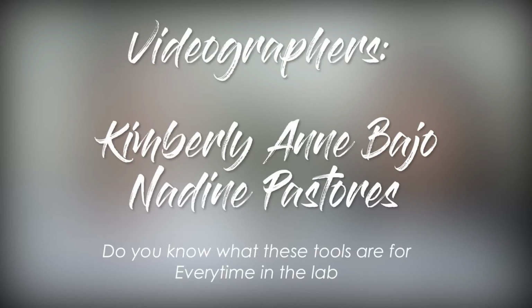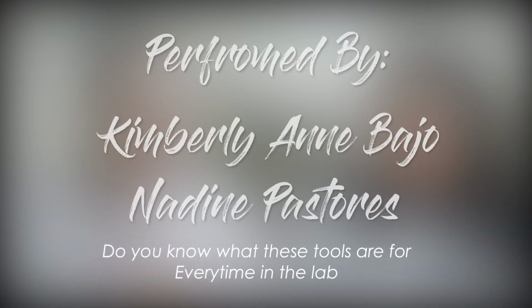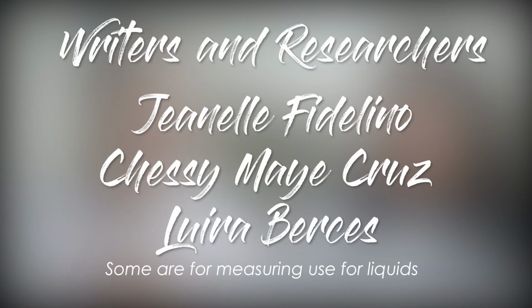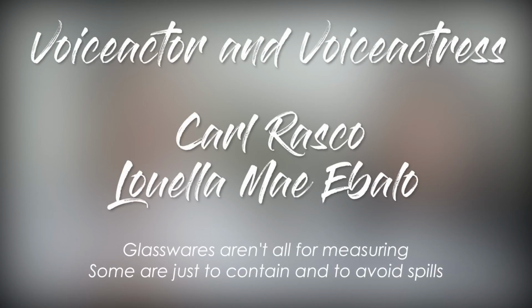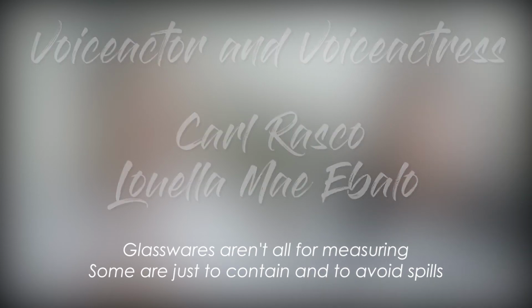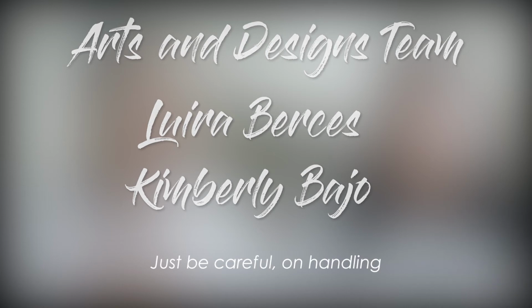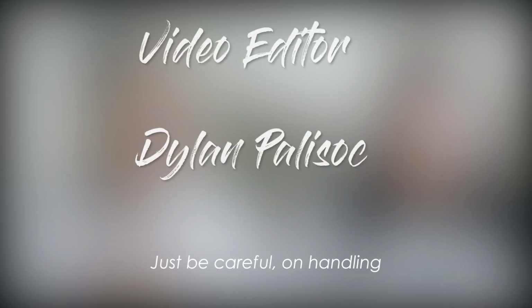Do you know what these tools are for? Every time in the lab, some are for measuring, used for liquids. Glasswares aren't all for measuring. Some are just to contain and to avoid spills. Just be careful on handling.